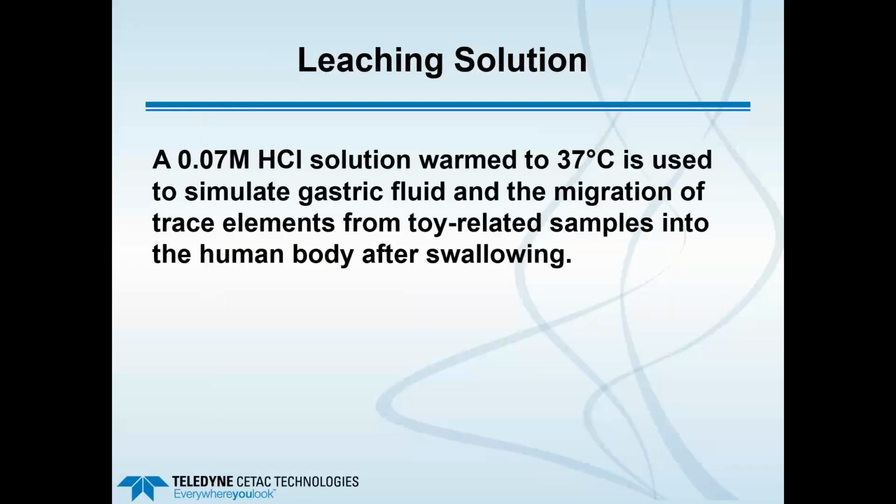So the leaching solution we're going to use is 0.07 molar HCl made from a high purity grade, warmed to 37 degrees C, and that is used to simulate gastric fluid and the migration of trace elements from these toy-related samples into the human body after swallowing.